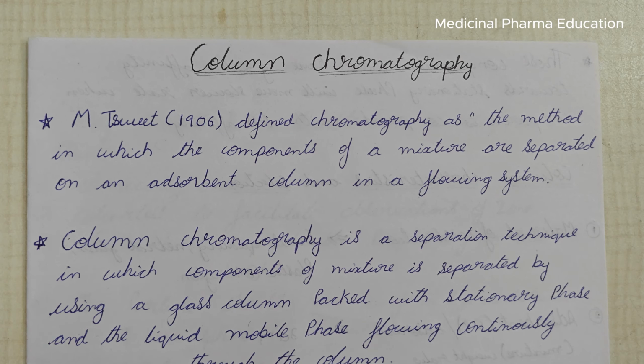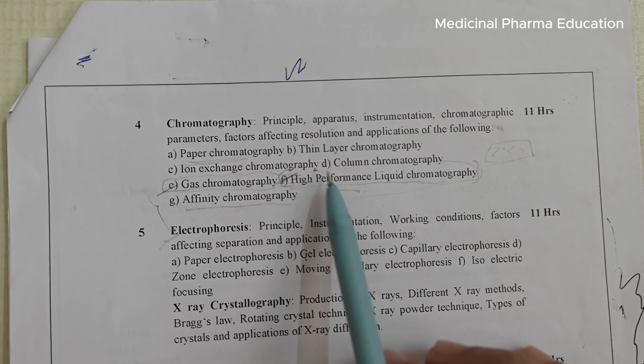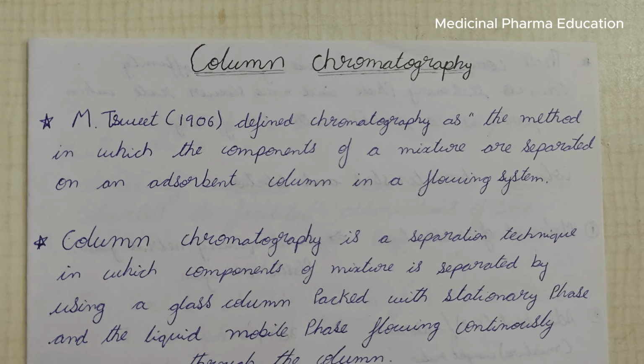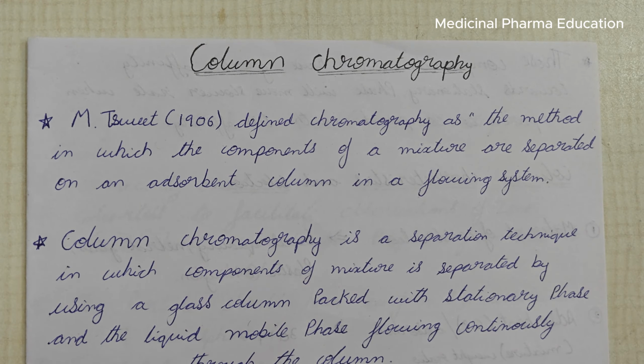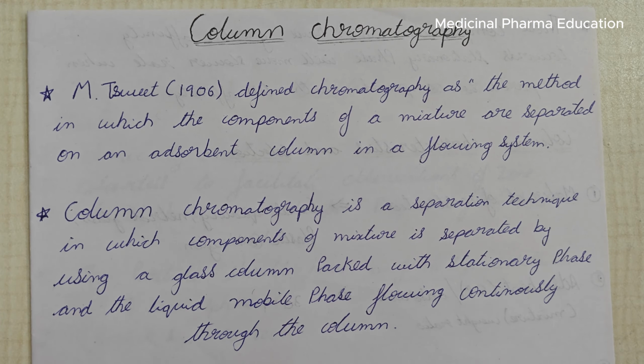I hope you are doing well and preparing for your exams. We have started with the chromatography chapter and completed paper, thin layer, and ion exchange chromatography, and in today's class we'll complete column chromatography. We'll start with the definition of chromatography.